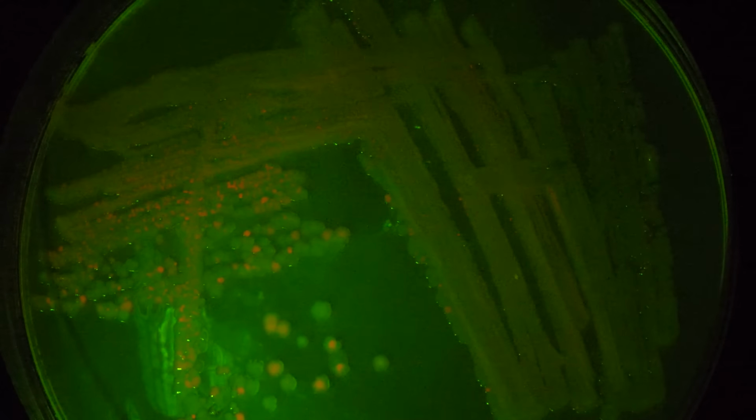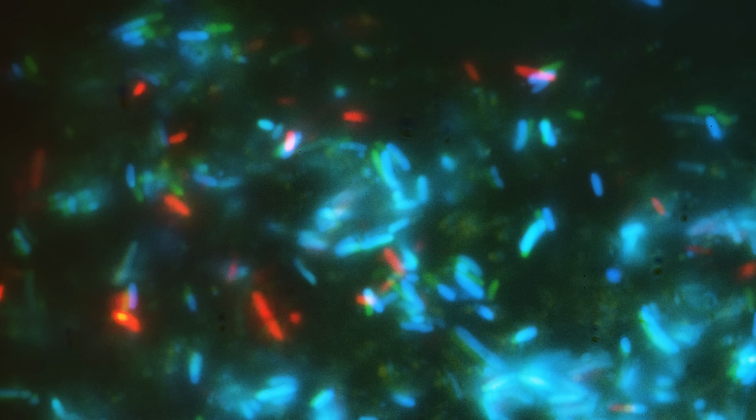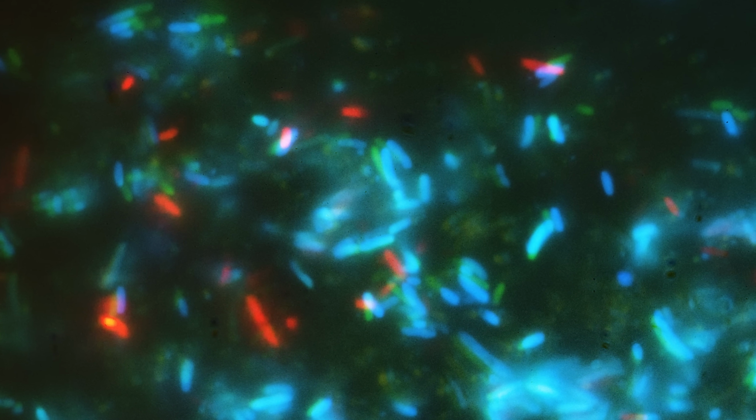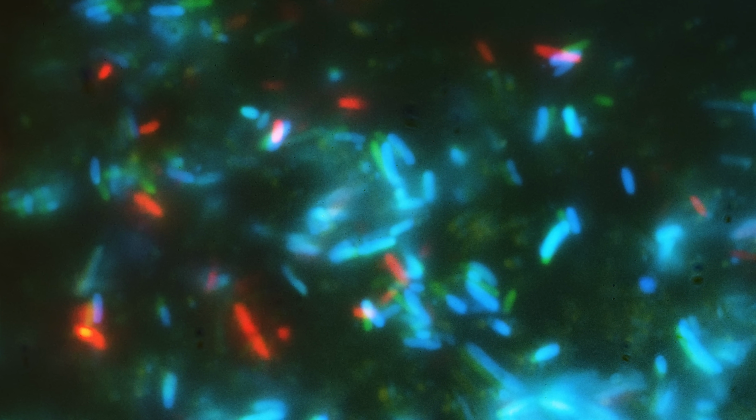In the original paper, their clock was so fast and consistent that they actually got concentric rings on their colonies. On mine, while there are a few colonies that had a bit of a ring structure, nothing like the original paper, which means that my clock must be running much slower. Under the microscope, we see all 3 colors, and the cells seem to only really express one color at a time, which is a really good sign.